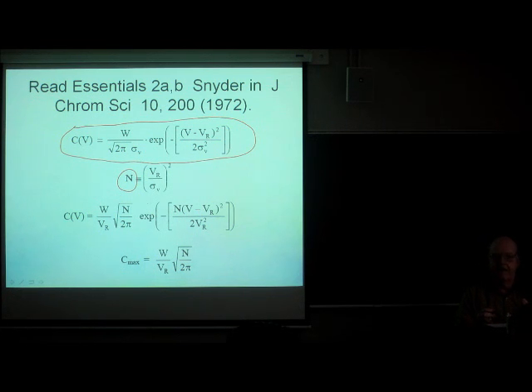But I can look at N as any pair of numbers I want as long as they have the right units. So it can be retention volume over the standard deviation in volume units, or the retention time over the standard deviation in time units. In the old days, when we didn't have computers, we often measured the volume in inches of chart paper. As long as you use the same units, you can calculate N by this formula.